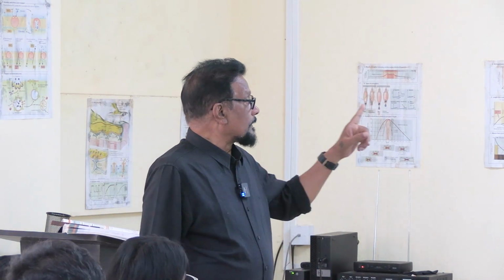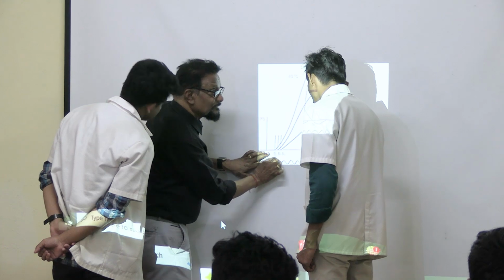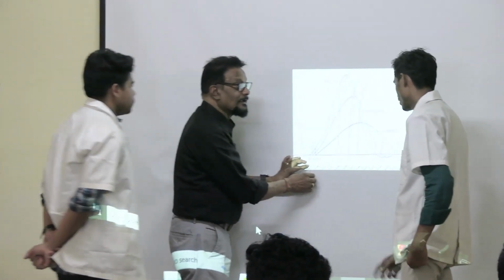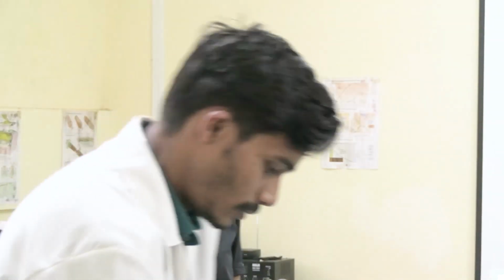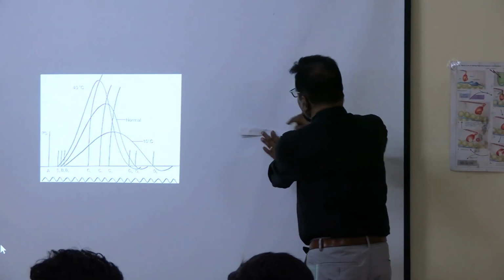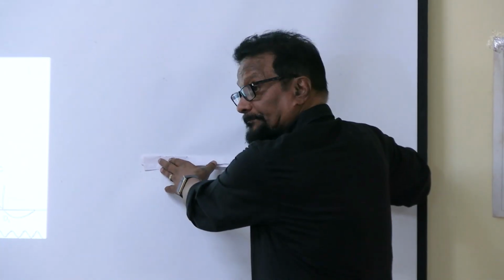Now what is the contraction period with 40 degrees centigrade temperature? 1, 2, 3, 4 plus this much, 4.2. 4.25. Yes, sir. So you are wrong. Sir, you are now convinced? Yes, sir. Okay. So 4.25 is the number of divisions in the contraction period. This is the long arm of the stylus of the lever.